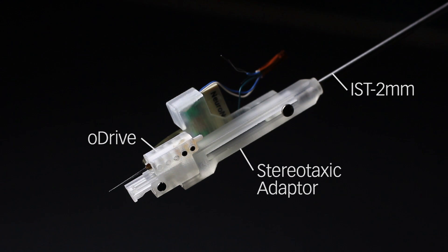The O-Drive arrives ready for surgical prep attached to a stereotaxic adapter. Neuronexus recommends sterilizing the O-Drive in its container with ETO before use.